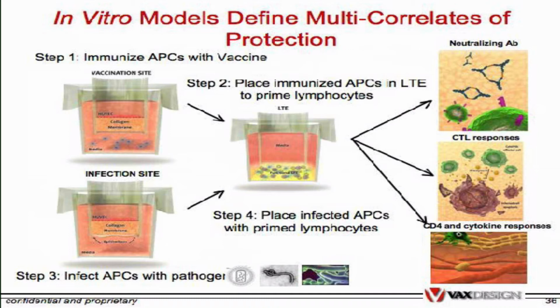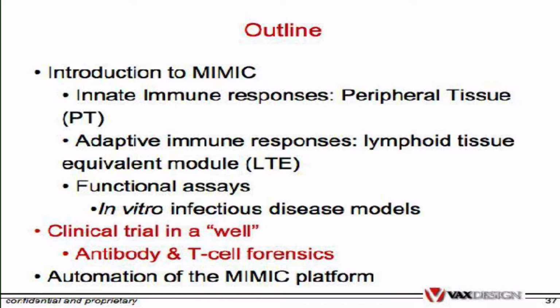And the ultimate readouts that we have are neutralizing antibody, CTL responses, and certainly cytokine and CD4 T helper cell responses in our system.